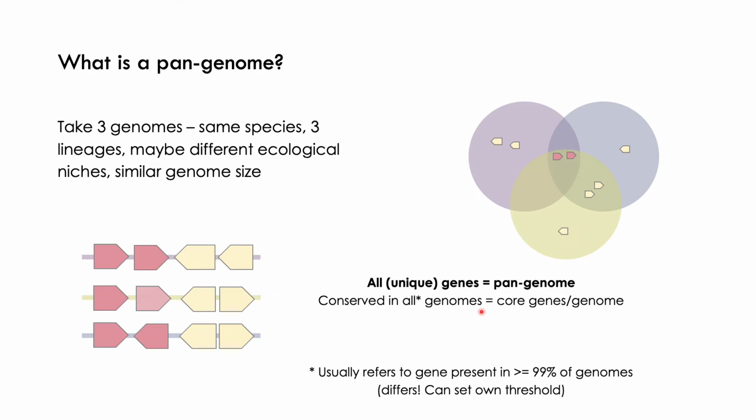And you do need to know a little bit about the diversity of your data set. Or you run it in complete default mode, and then you run it again after you've got your first results, and you temper the threshold based on the results.